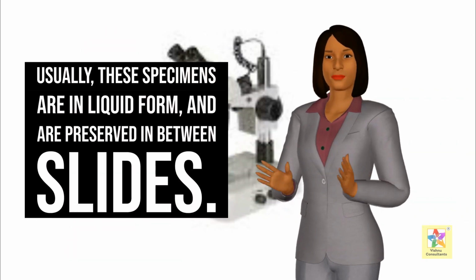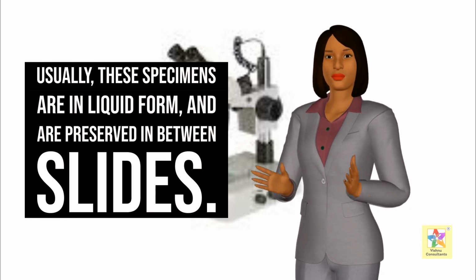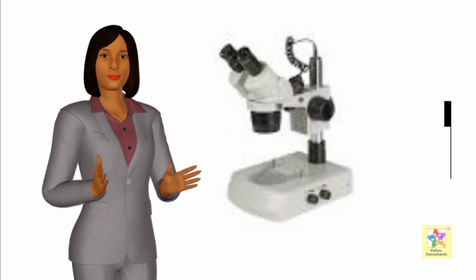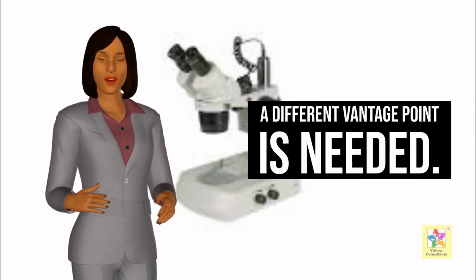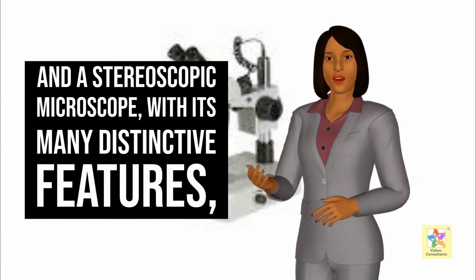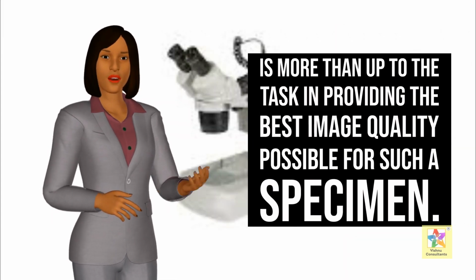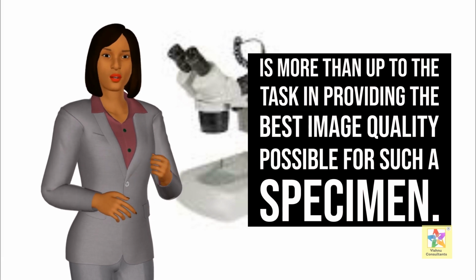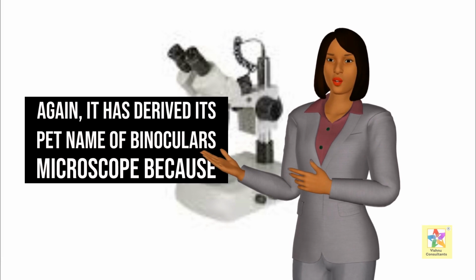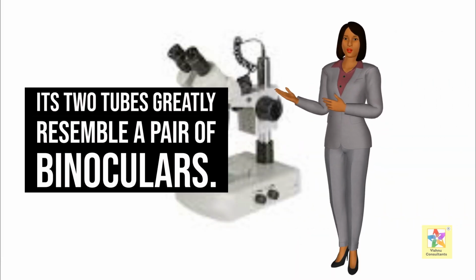Usually, these specimens are in liquid form and are preserved in between slides. But for a study of a 3-dimensional specimen which is solid, a different vantage point is needed. And a stereoscopic microscope, with its many distinctive features, is more than up to the task in providing the best image quality possible for such a specimen. Again, it has derived its pet name of binoculars microscope because its 2 tubes greatly resemble a pair of binoculars.